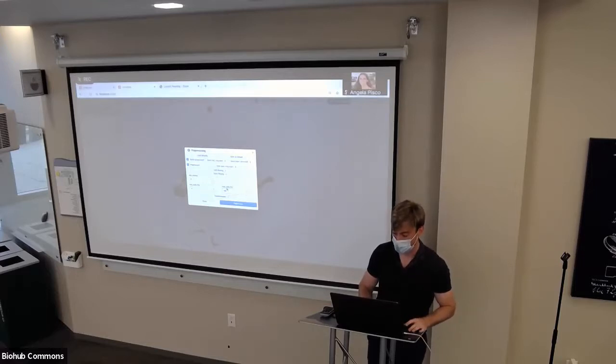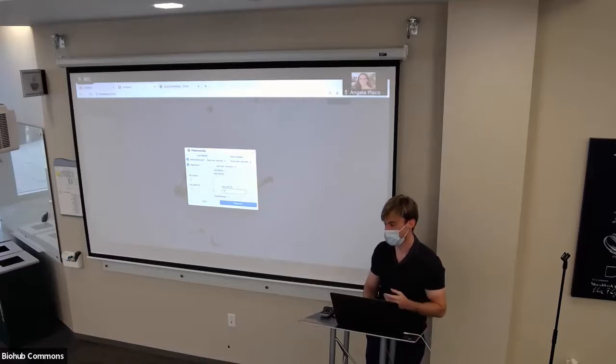And this one is the maximum number of cells that a gene should be expressed or detected in before you start removing these genes. So typically this is like 99. If it's in more than 99% of the cells, it's probably a housekeeping gene. So just remove it.